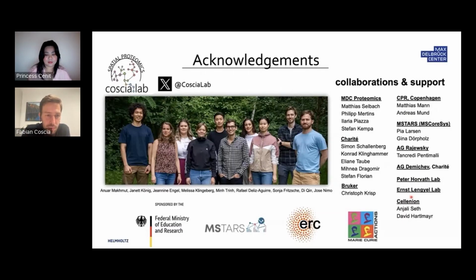And this is exactly what you will need if you want to find new biomarkers, if you want to find novel protein-based drug targets. You need this discovery mode approach where you can analyze and compare thousands of proteins simultaneously and then only look at the ones that show the strongest response, that are most reproducible, and that can then hopefully be validated in additional data sets. So certainly, I think this is one major advantage of mass spectrometry-based spatial proteomics.